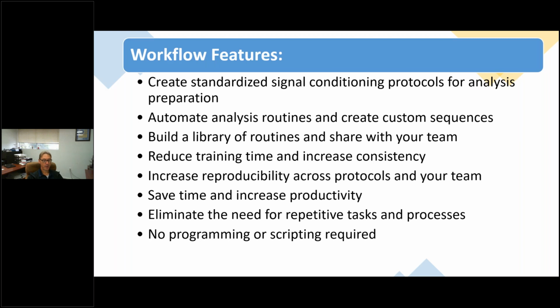You can create these workflows and then you can share them with your team. So you can have different workflows for different types of analyses or different types of data preparation before you get to analysis. And then as long as your team don't go in there and modify the workflows, they become like a standard operating procedure for that part of your protocol.